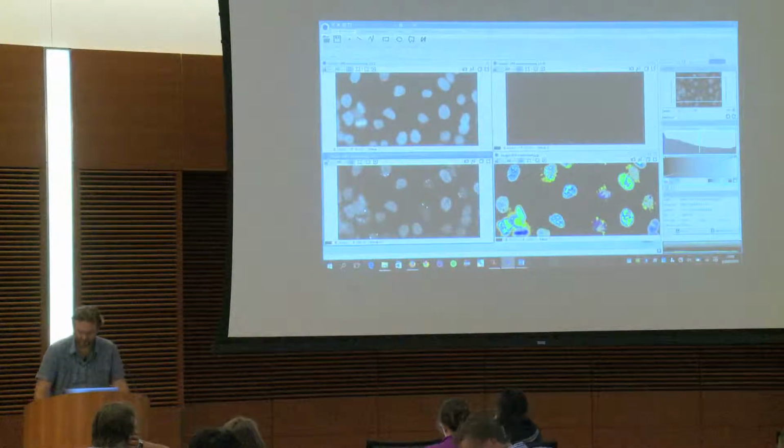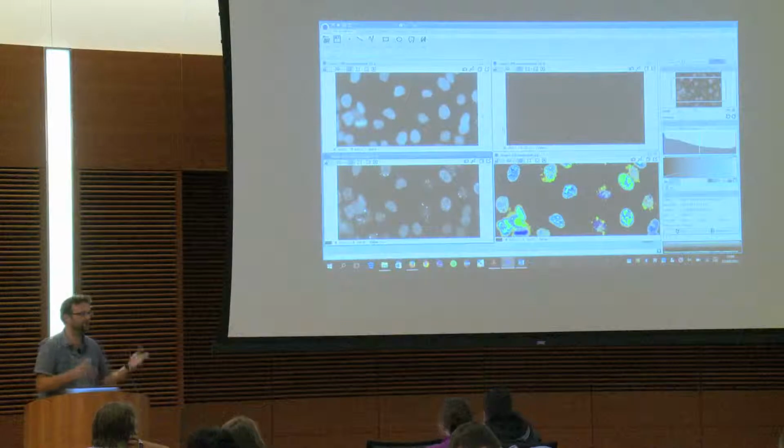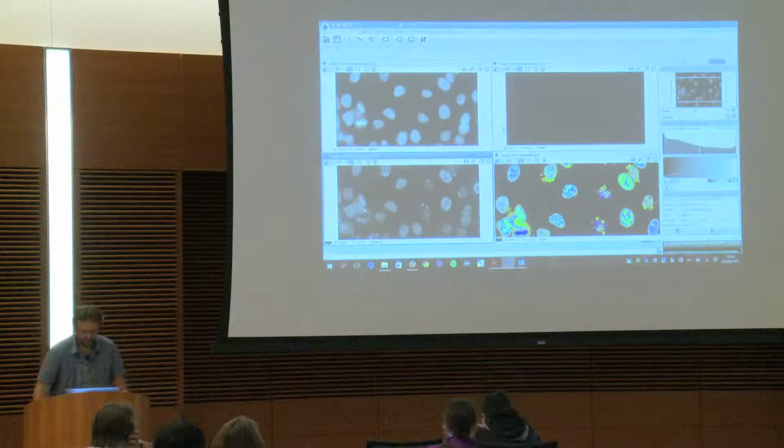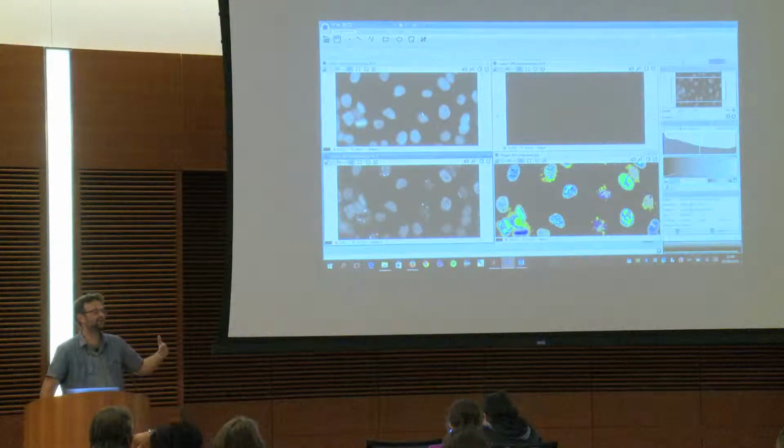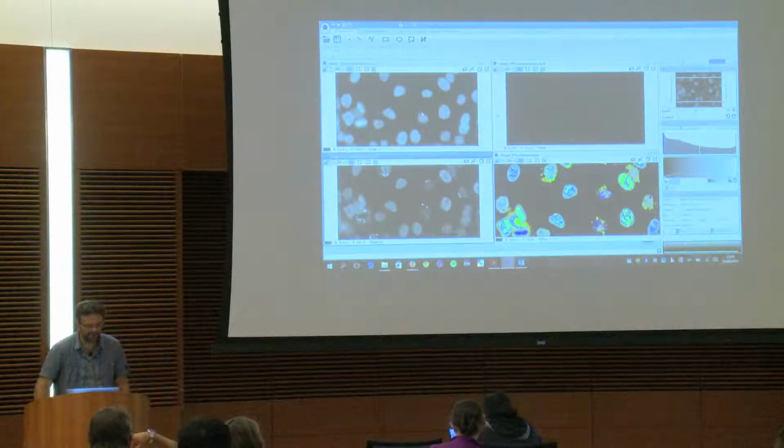So of course you can save your own lookup table if you always use the same. It's easy and they will be recalled automatically. If you just close an image and then you reopen it, we save the metadata and also the lookup table, so you will have the same rendering when we load it back.